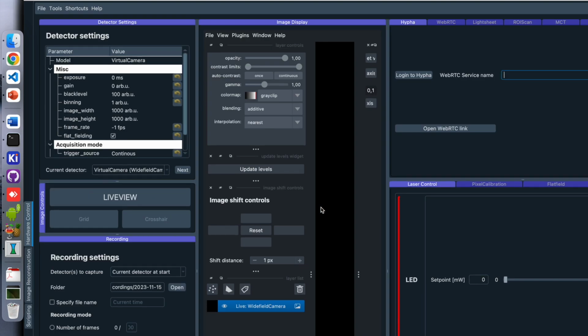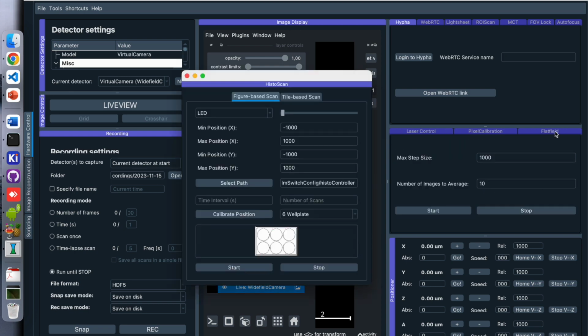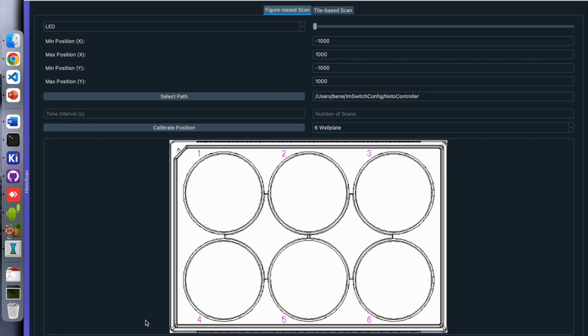So let's say, okay, you home your microscope so that it's at the 0, 0 position. So there are these home buttons where it should move to the 0 position of the microscope, so to the final end position. Whereas I'm not quite sure whether this is implemented correctly in your case, but this we have to find out. And then if we're talking in the microscopy coordinates, maybe somewhere here. So this is defined as 0, 0 coordinate here.